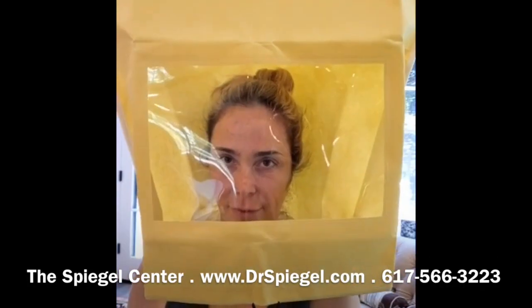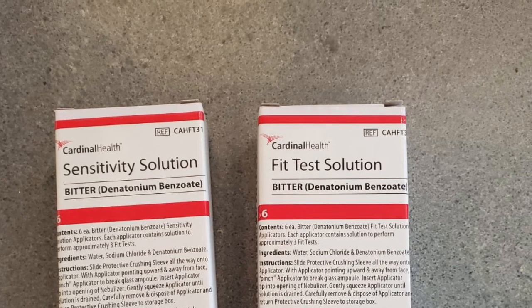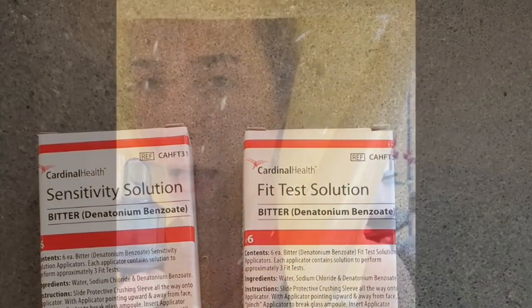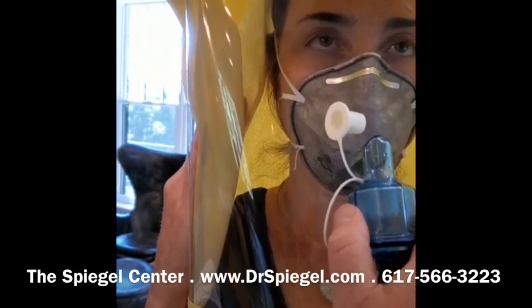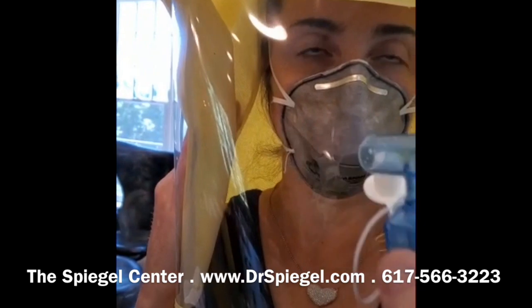We've got the fit testing hood on Dr. O'Near. Now we're going to test to see if she can detect the testing material. This is how we test for the ability to detect the Bitrex solution, and then the initial test amount is placed back into the hood.